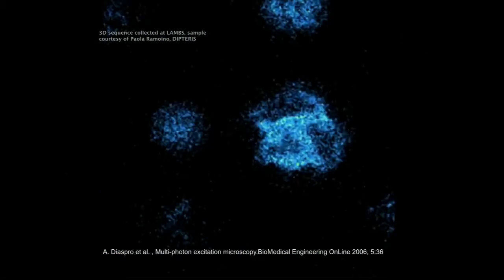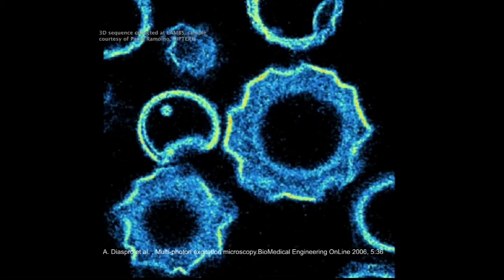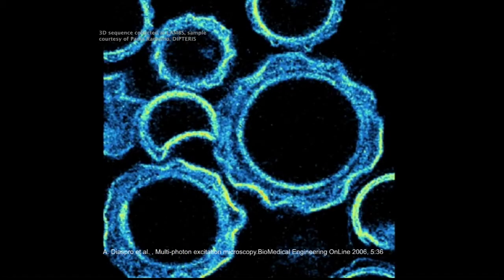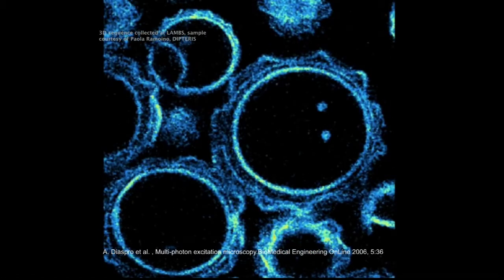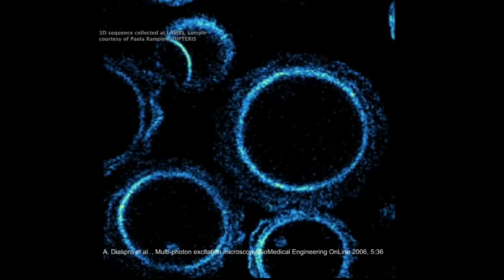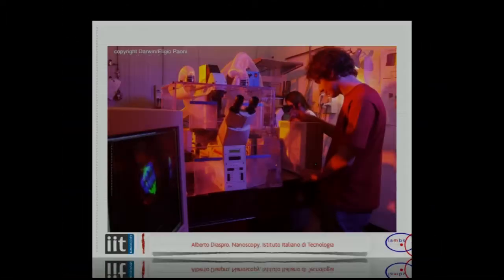And so if you shine your excitation at a different focal position, this is autofluorescence coming from membranes of the sample. You see from every region a good contrast image, changing plane by plane, without contamination of the background when using autofluorescence. In case you are shining 360 here or something like that, you would see a blob. Then you can use a pinhole in your confocal for reducing something, but it's a blob. In this case, you can really discriminate plane by plane what's going on using this kind of excitation.